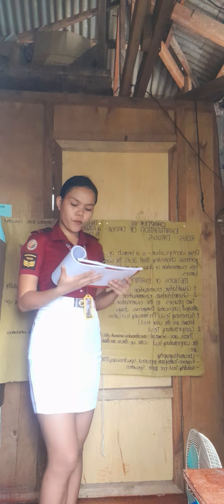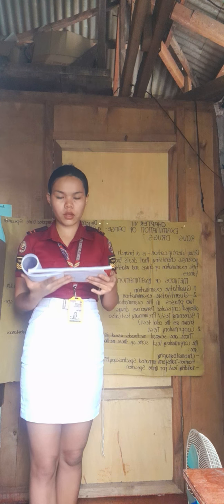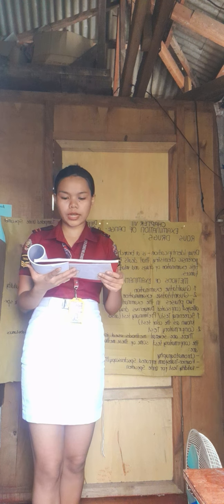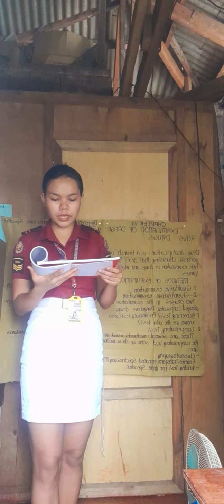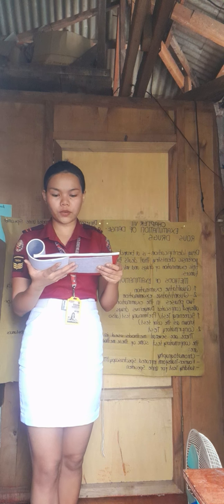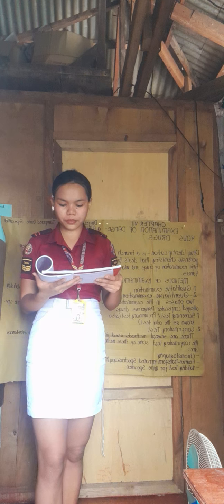Next is Fourier transform infrared spectroscopy. So it is used for the identification of pure organic substances. Identifies organic substances, particularly dangerous drugs and excipient ingredients based on their characteristic functional groups.